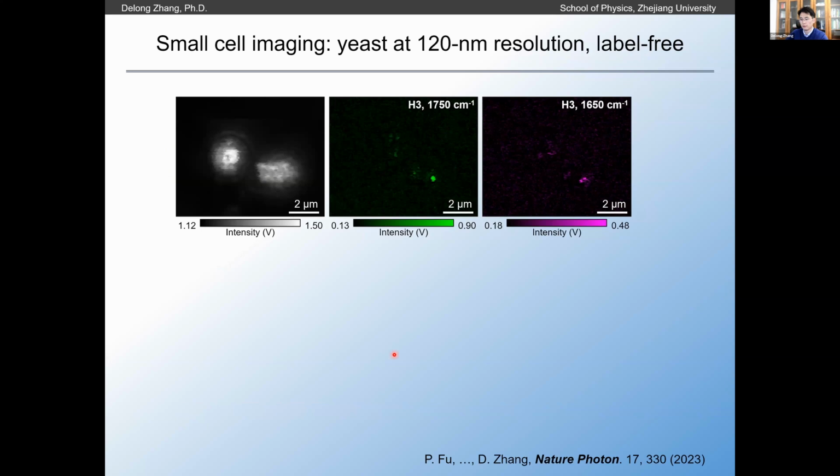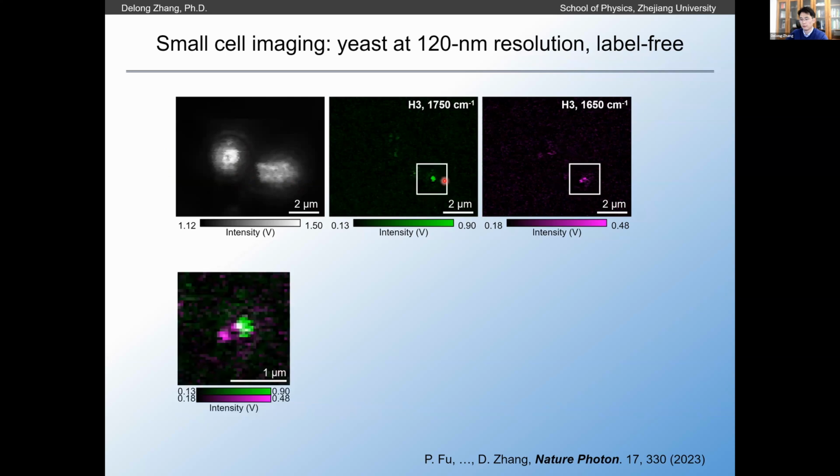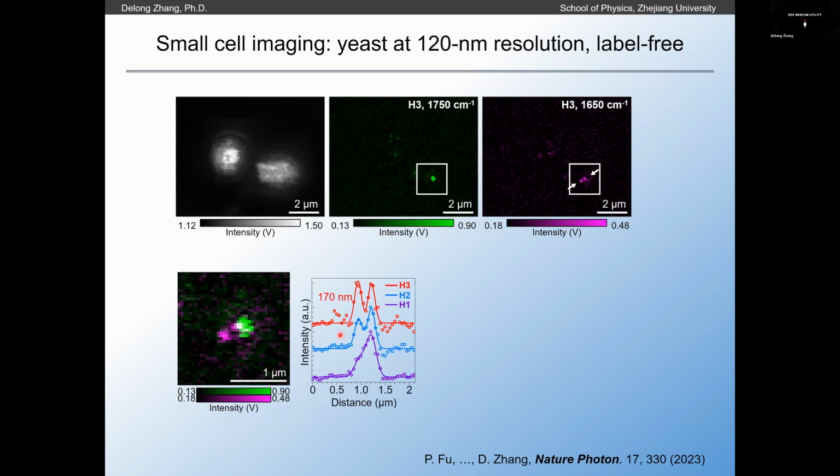Another interesting thing is that when we observe this very small model organism, these yeast cells, which are very small as you can see, and we tune to the lipid channel and the protein channel, we see that there is a spatial separation between these two droplets.